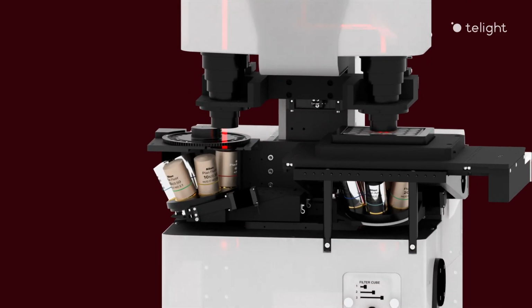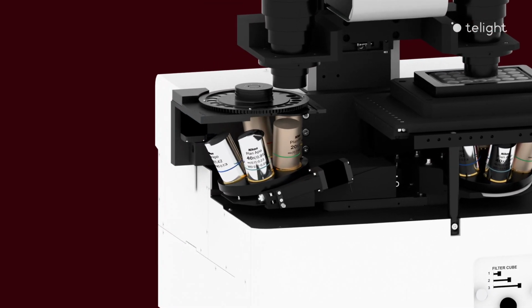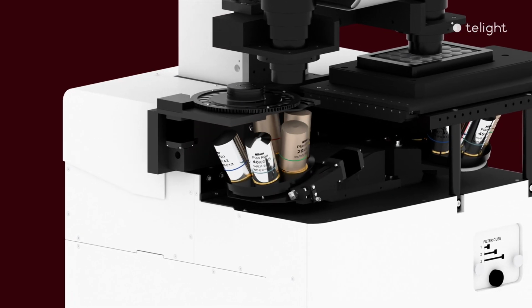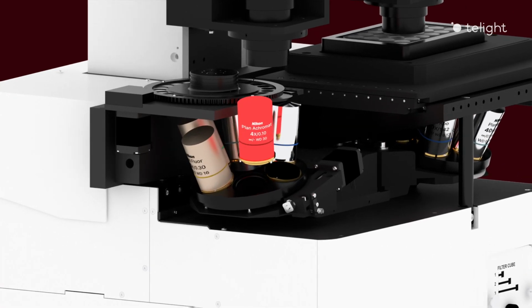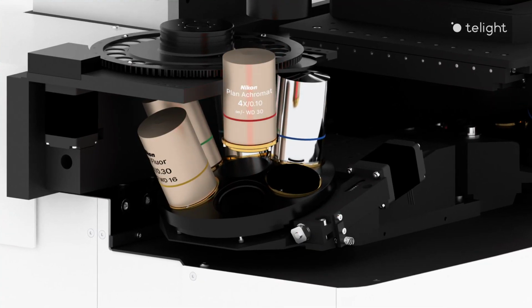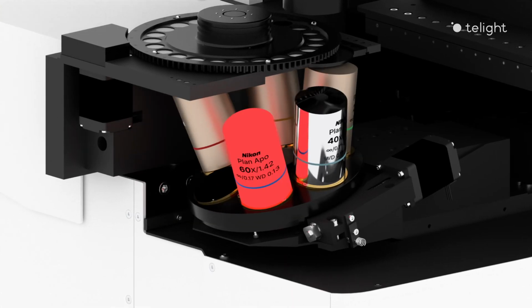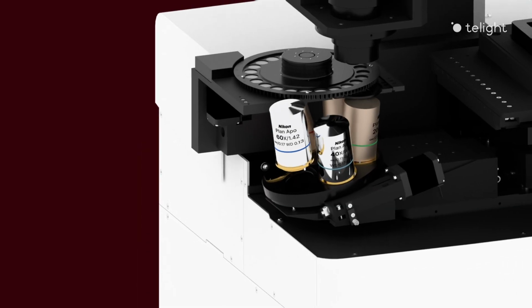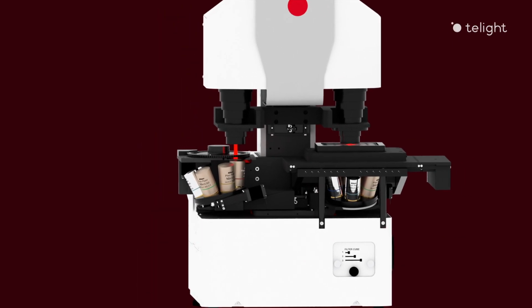For the observation of specimens of biological nature, it is quite fine that we can choose one of several objectives in the turret. For example, we can use a low magnification objective to have some context of the field of view, and then use a high magnification, high NA objective to observe some details, for example, behavior of individual cells or of some subfield of the field of view.